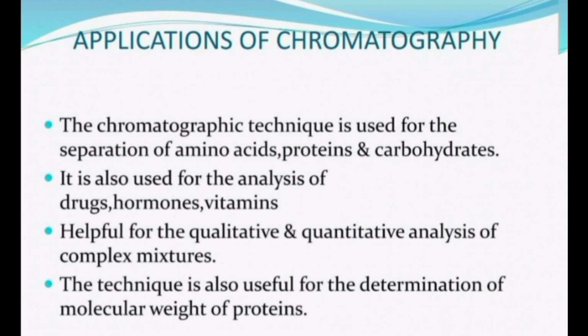Finally, we discuss applications of chromatography. Chromatography is used in many methods and fields, so we look at some applications. First, the chromatography technique is used for the separation of amino acids, proteins and carbohydrates.